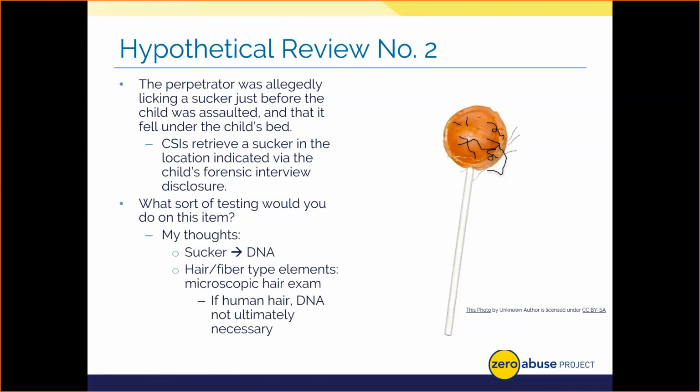What about the trace evidence here? I go ahead and take a look at the different hair and fiber items and try to identify if anything was a human hair. I try to identify if it had a root or follicular tag, since that could be another source of DNA to corroborate claims by the child and support the victim or the suspect being in the room from which the sucker was retrieved. Getting really detailed here, I'd number the amount of each hair and fiber type on the item, since it looks like there might be two different distinct types. And I'd catalog them as sub-items, but I'd probably hold off on testing them.